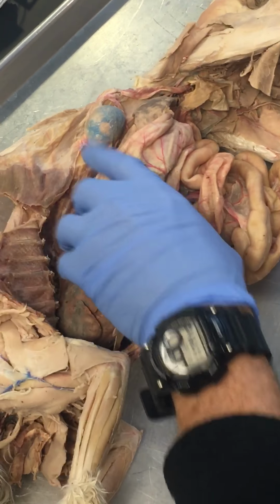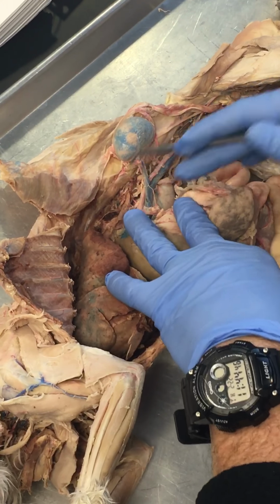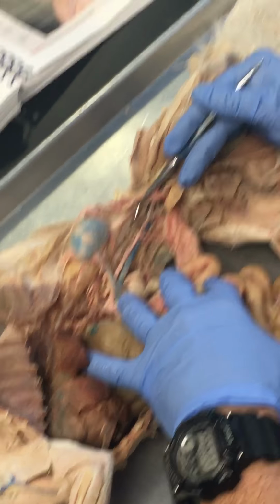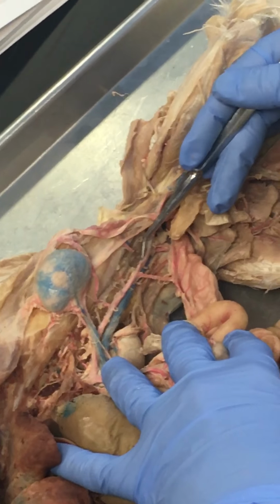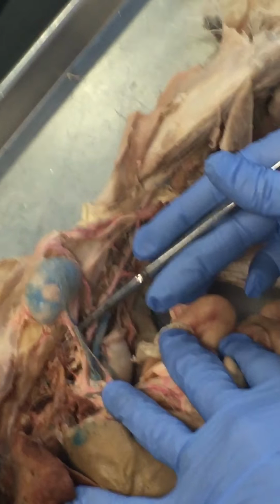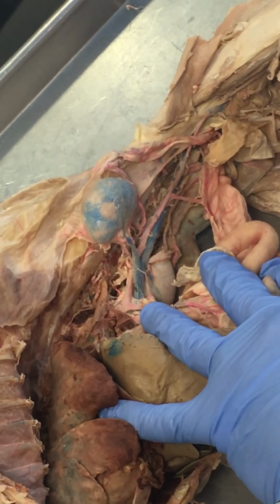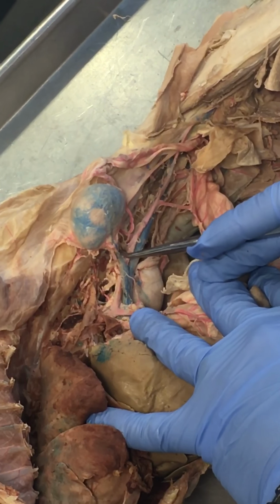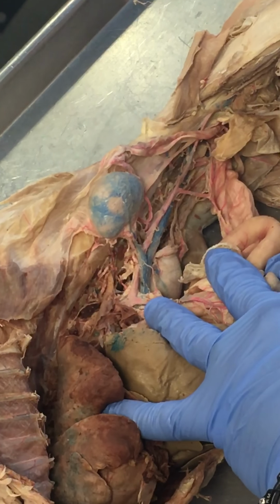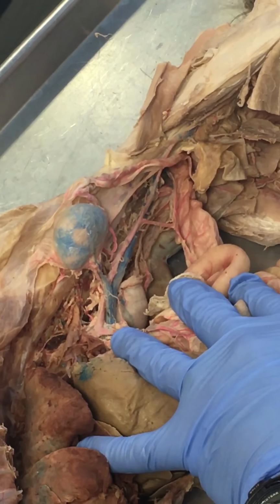Adrenal lumbars. Okay, so adrenal lumbar veins, of course, are going to run with the adrenal lumbar arteries. The adrenal gland's been obliterated here, so it's not evident. Iliolumbar, of course, it's going to run with the iliolumbar artery down here. That's iliolumbar, coming off inferior vena cava and the abdominal aorta. Renal vein, renal artery. Testicular and ovarian veins, we already talked about that, right? Left testicular vein, ovarian vein goes into the left renal. Okay, left renal. And then we talked about the iliacs down here too, how they were different, didn't we?